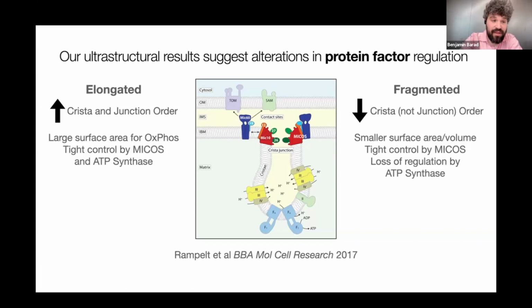So I was really excited about this. This was the proof of principle of why this ultrastructure-first approach was great. But I did mention at the front that what we want to do is all three in one paper. You want to be doing not just ultrastructure, but how protein structure is impacting it and how these different scales are interacting. And that's not in this paper, really.